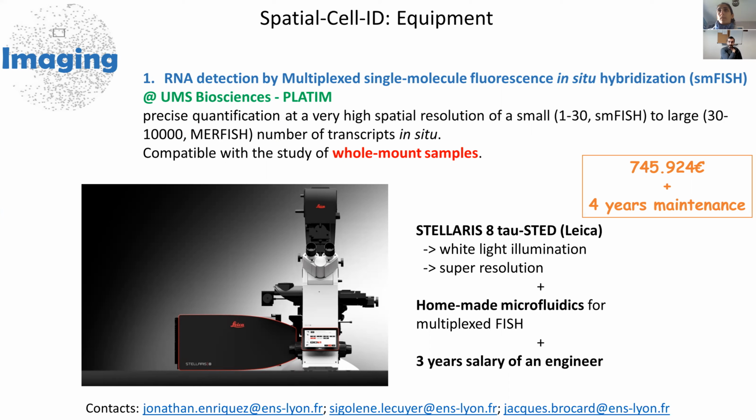So we are going to build a machine around the microscope to do the hybridization, and the microscope will take the picture. As you can imagine, this module will need a lot of development. That's why we are going to hire an engineer for 3 years to help us build this facility.